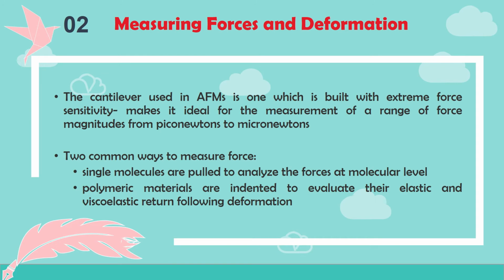The cantilever used in AFM is built with extreme force sensitivity, which makes it ideal for the measurement of a range of force magnitudes from piconewtons to micronewtons. There are two common ways to measure force. Single molecules are pulled to analyze the forces at molecular level, or polymeric materials are indented to evaluate their elastic and viscoelastic return following deformation.